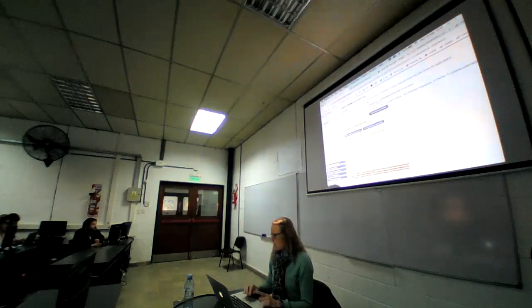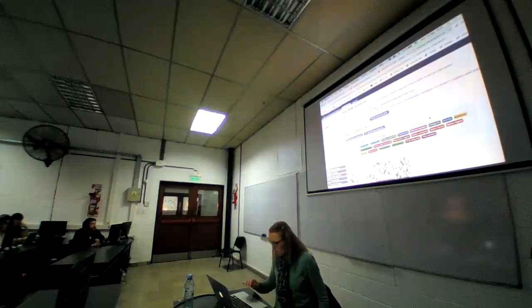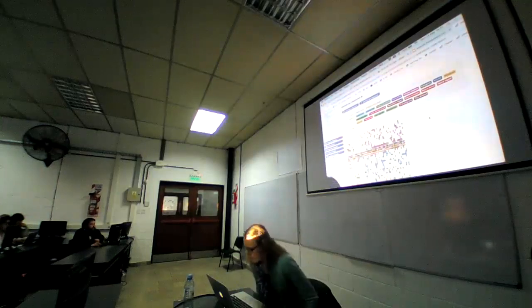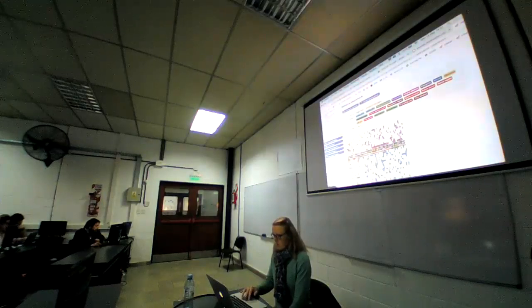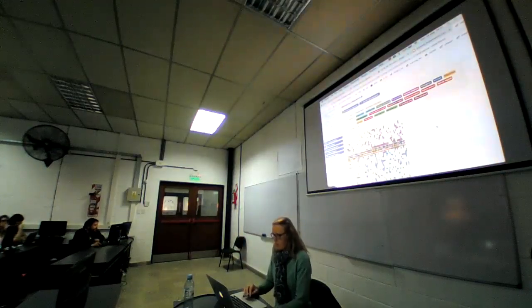This takes a long time because there are many variants. So I have this page preloaded for this gene, and it looks like this. So in addition to my exons, which are labeled in red and yellowish background, I now have variants added to this page. They have a separate legend here for the variants.